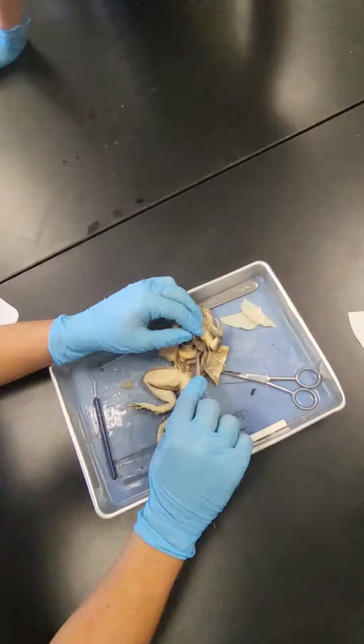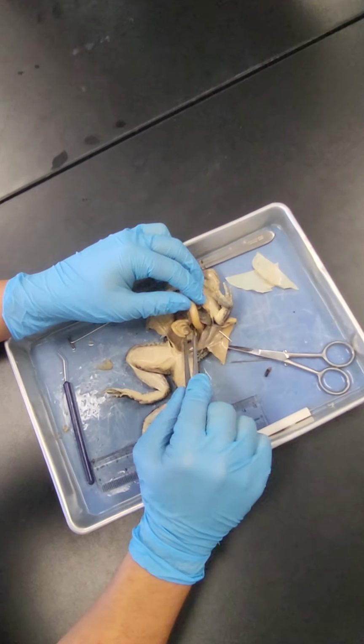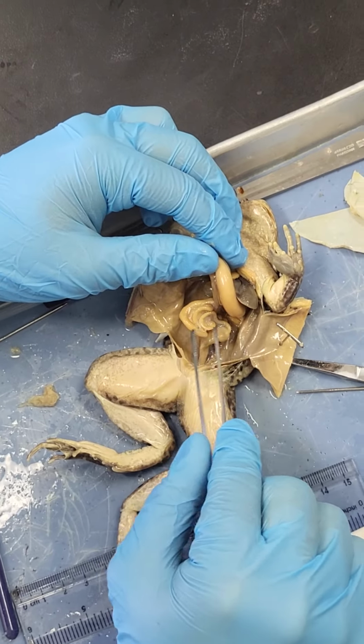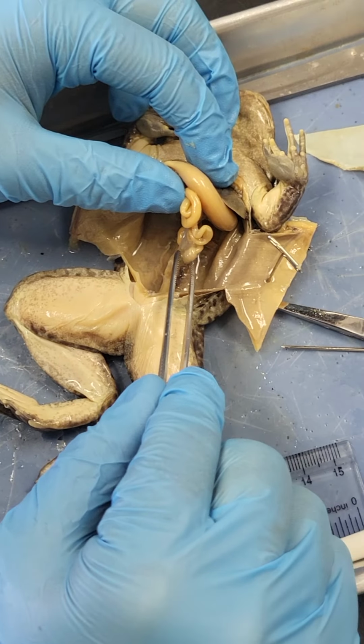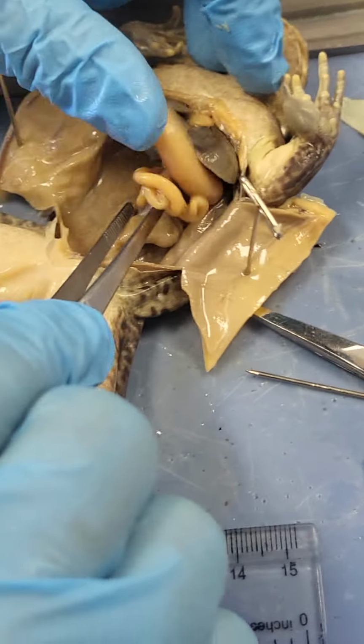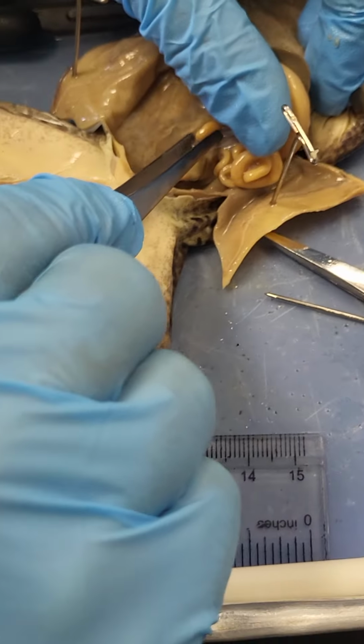Yeah. Stomach. Found that. Right here. Small intestine. It's leading right from the stomach. Yep. Large intestine is gonna be right here, below. Yep. The spleen. It's right here. Below. Yeah. Yep.